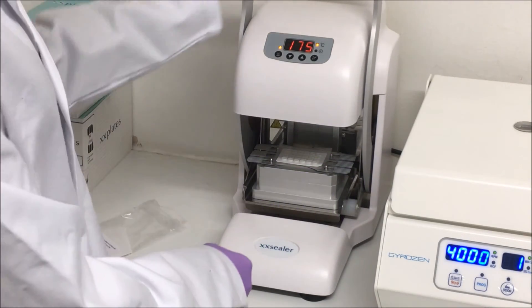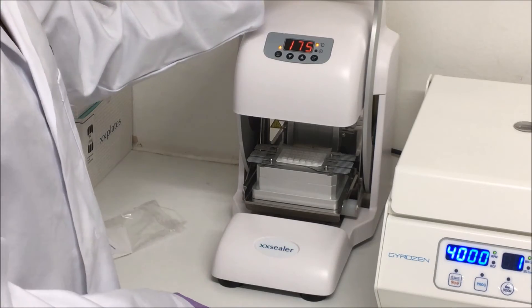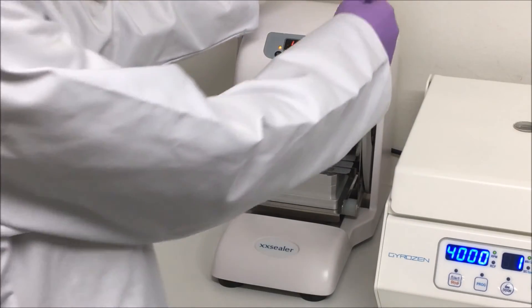The machine operates at 175 degrees Celsius for one and a half seconds and you simply press the handle down to operate.